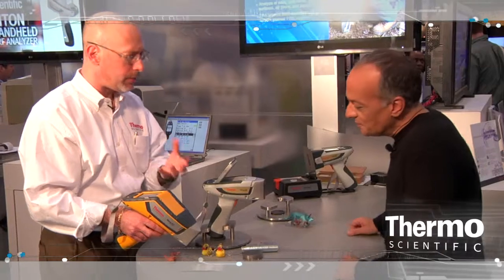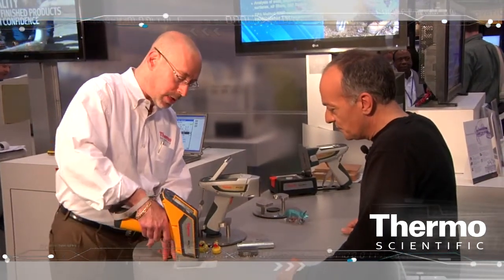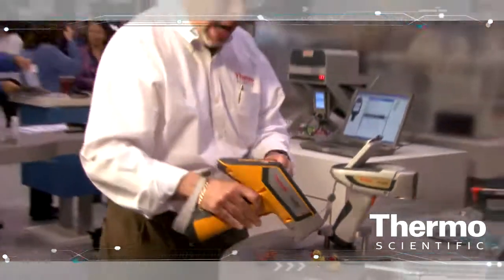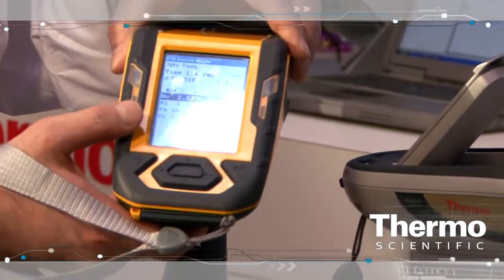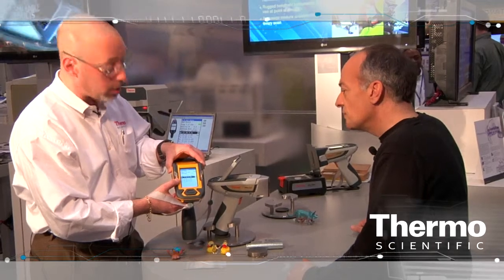To operate the instrument — a very similar user interface to the Niton XL3 — you put the instrument on the sample, squeeze and hold the trigger, and in less than two seconds we've identified it as a 316-grade stainless steel with the percent by weight of the molybdenum, the nickel, the iron, and the chrome. It's that easy to use.